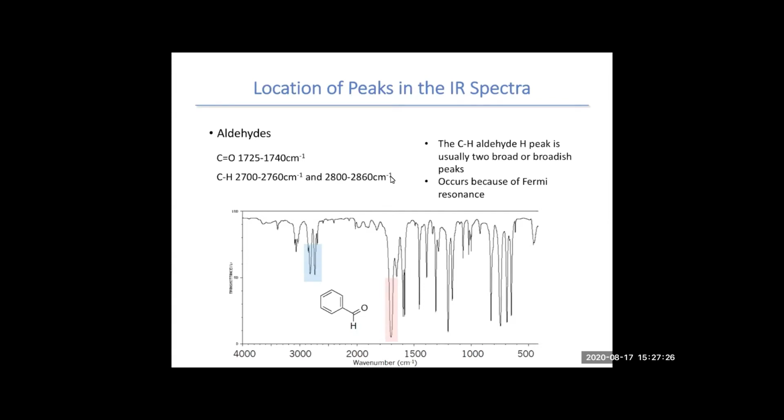And you'll usually see kind of these two peaks here. It can be a stronger peak like this, or it can be a weaker peak. But you'll still see those two distinguishing peaks. Remember, the carbon-hydrogen sp3 peaks start at 2800 and go to 3000. So when you're trying to determine if you have an aldehyde, look for these CH peaks. That's your distinguishing structure and your distinguishing peaks in your IR spectra.